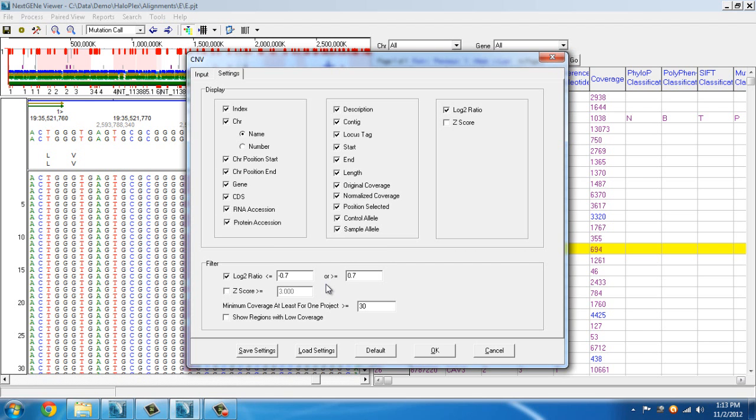So that can obviously make detection difficult since there is some variance in the number of reads covering each region even after normalization. The z-score indicates the confidence that this change is real, and it's based on the amount of coverage, the maximum score being 20.